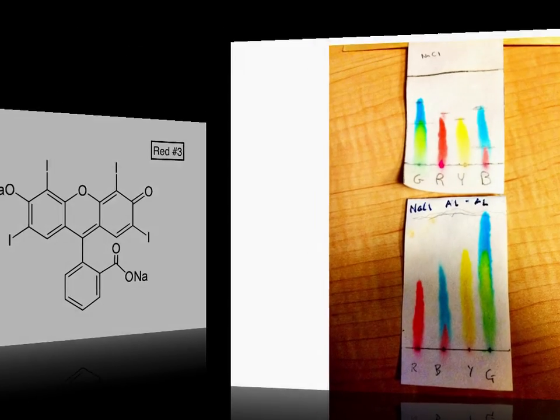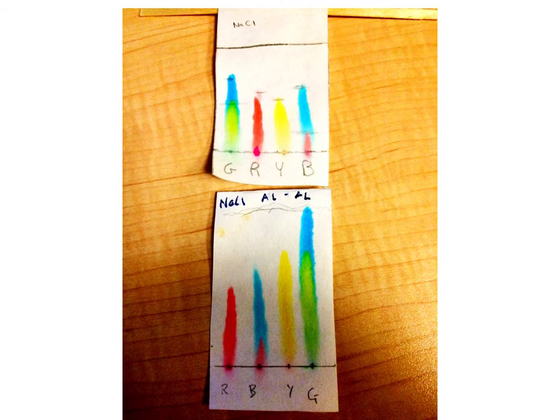And finally, when you look at the strips, you can see that, in fact, many of the food colorings, I should say, are actually mixtures. Okay, whether it's intentional or not. The green, obviously, in this situation at least there is no green dye. There's actually a yellow and blue dye. You can see that very clearly in both of the strips here.